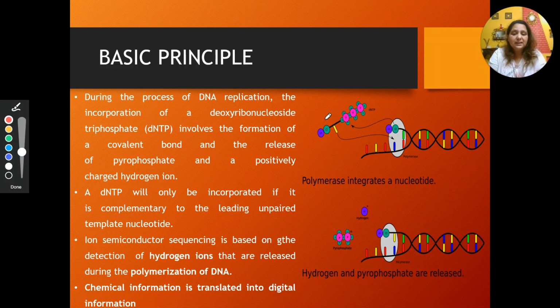So what happens is that when DNA replicates, in that process, whenever a nucleotide, for example, here you can see that we are directing this nucleotide complementary to this position, such as blue always pairs with the yellow one here. So once the yellow nucleotide pairs with the blue one, that means the complementary nucleotides pair with each other.